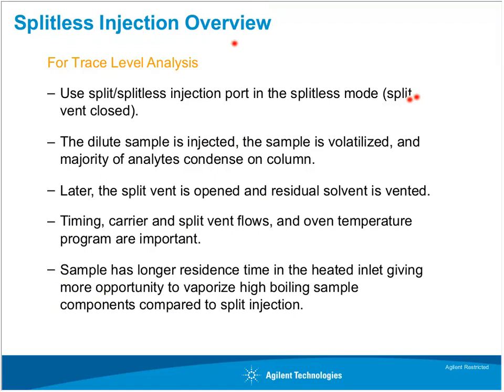And again, the timing of your split vent, your purge time, your split flow basically coming back on, can be really key in making sure that you're doing that right and not having any issues. Split vent flows become important at that point, depending on the type of residues that are in there. You want to make sure that you're really pushing them out the split vent, giving it enough time to evacuate the inlet before your next injection.